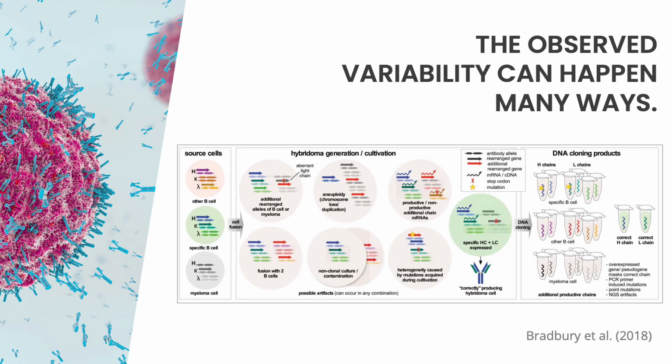Now, these are not rare circumstances. A single additional chain happens in about 30% of cases, and we see multiple chains in an additional 3% of cases. So roughly 1/3 of the time, these variable numbers of chains pop up. And these can happen all over the place.